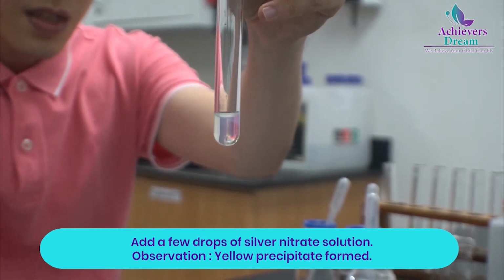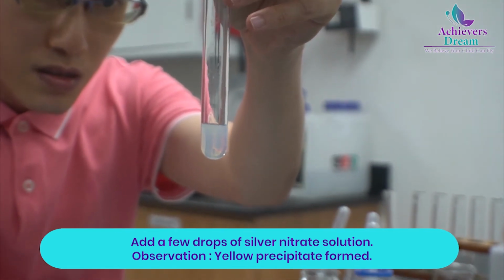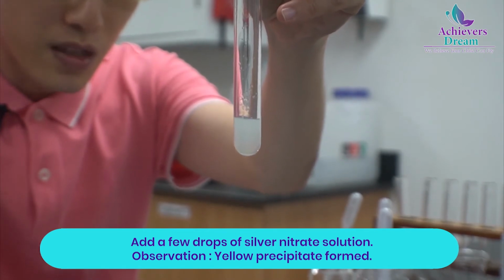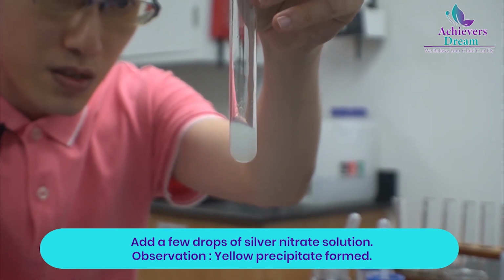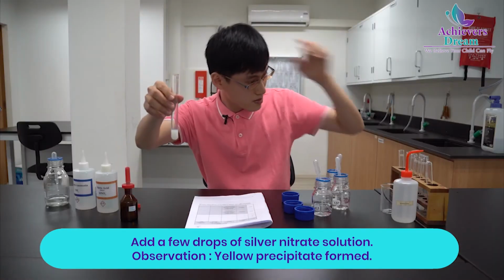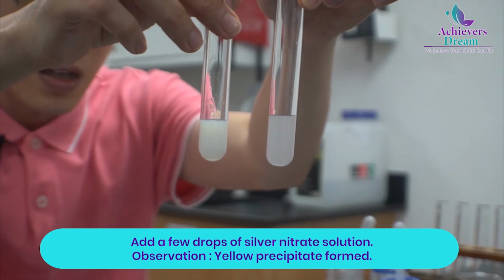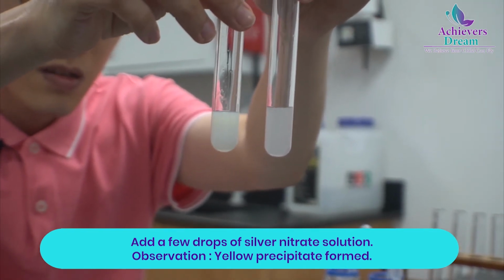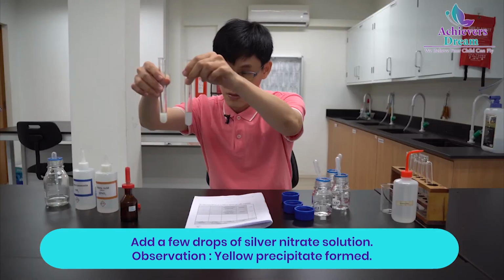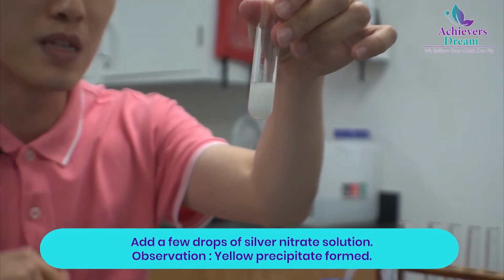Okay, there's a precipitate. It's a bit yellowish. The color is to the yellow side. It's a bit whitish, but there's more yellow than white. Contrast this with the precipitate that we got for silver chloride just now. See? It's a bit yellowish, right? Yes. So this is the yellow silver iodide precipitate.